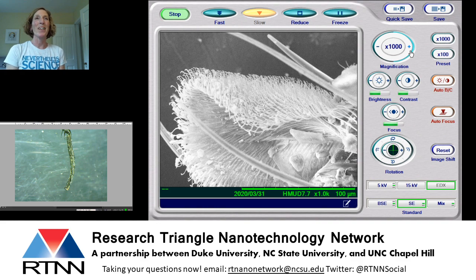Okay, I've got one last thing to show you guys before we finish up today, and that is the face of the fly. Unfortunately, fly face is so cool that when I cut it in half to put half in the electron microscope and half in the light microscope, I didn't want to accidentally miss part of the head, and so I didn't actually cut the head in half. So I don't have a light microscope part to show you. I just have the electron microscope part. But I promise you, it is so cool, you won't be mad at me.